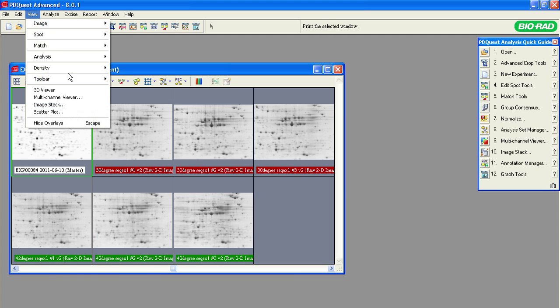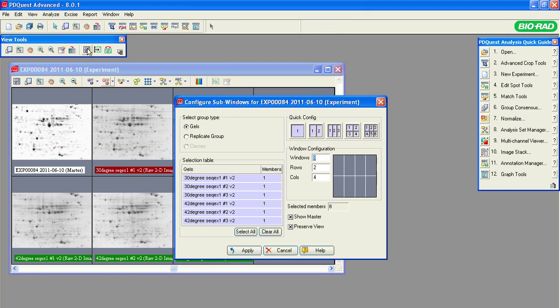Go to View, Toolbar, View Tools, and click on the icon that looks like 4 squares. In the selection table, highlight 42-degree number 2 gel, set Windows to 2, and check the Show Master box, then click Apply.